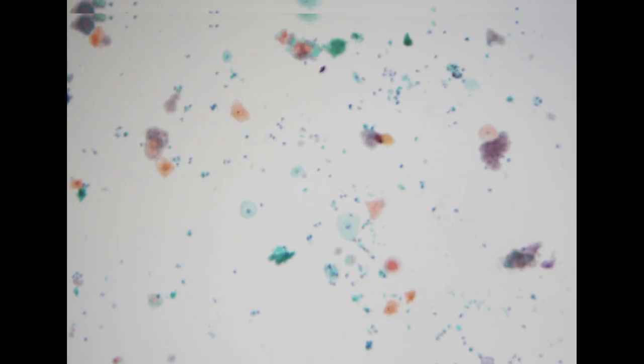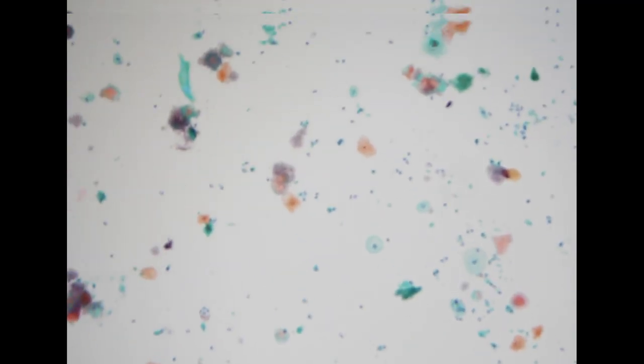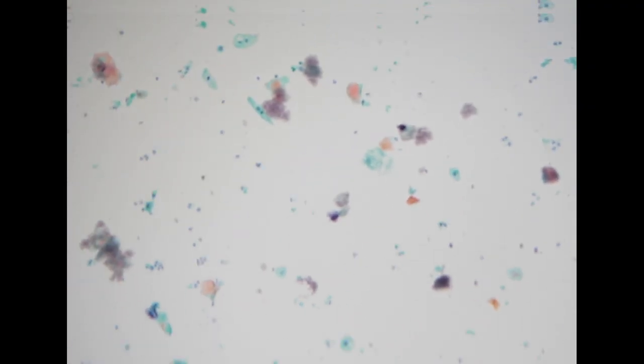So on low power, this is a voided urine specimen. On low power, we see some superficial cells, superficial squamous cells. Most of them were likely coming from the external genitalia, maybe from the urethral meatus or the foreskin.